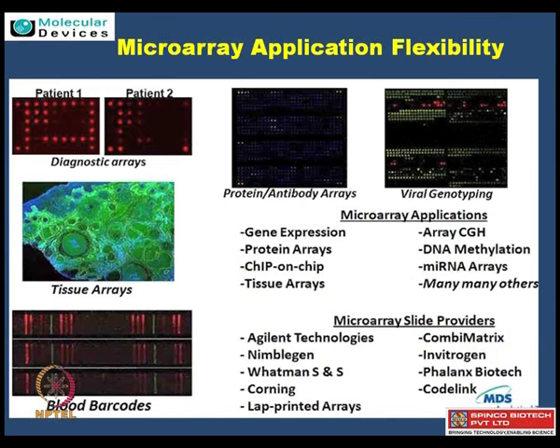And the protein arrays are now really catching up in many senses, because the protein is actually the biological function, what many scientists believe, right. And I am also a strong believer. So now people are moving from the DNA to the real functional part, how they are directly affected. The major bottleneck was looking at the antigen antibody reactions, like the proteins are all being seen. There is no general formula, but now the field is catching up. So even at the level of protein arrays, this is compatible. The incoming tissue arrays, which are really in infancy, are also now compatible with GenePix Pro.